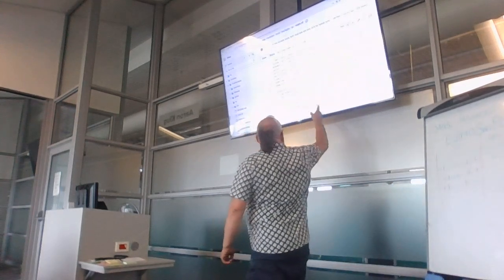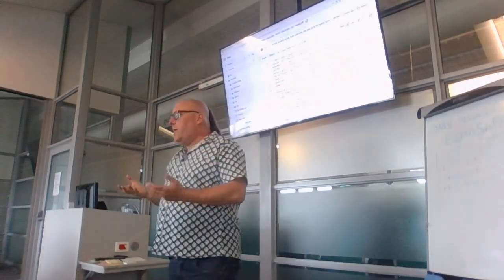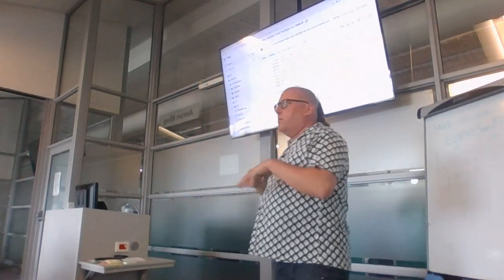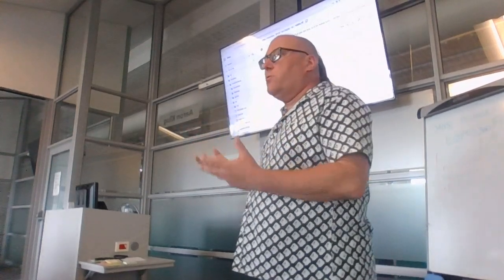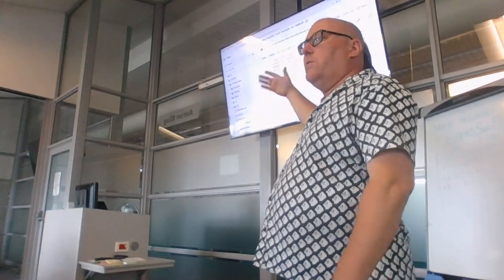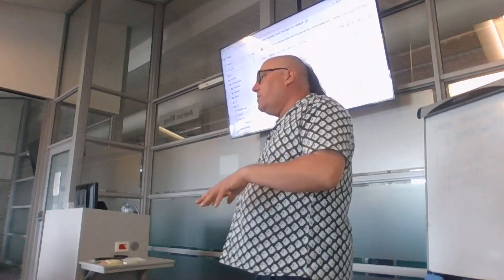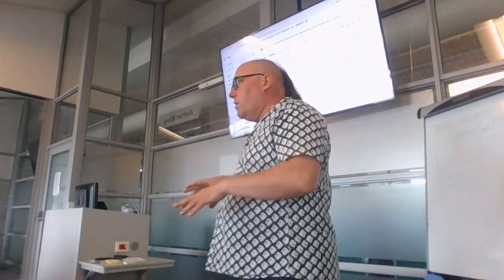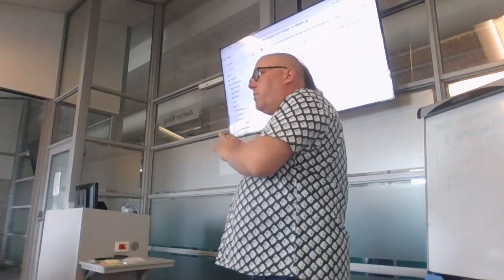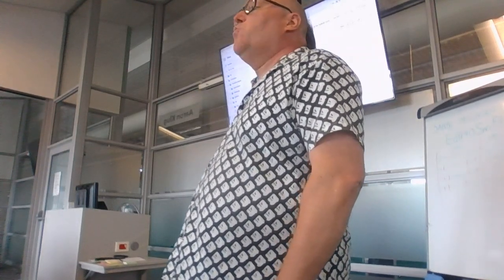But then this quay.io, this is one of the big Docker container repositories, and it's used to lots of people downloading things. So it's, in my experience, the Docker downloads are faster than the Singularity downloads, okay? But it depends on your environment, whether you've got Docker, whether you've got Singularity, okay? So yeah. Does that happen after installation? That happens when you run the workflow for the first time.